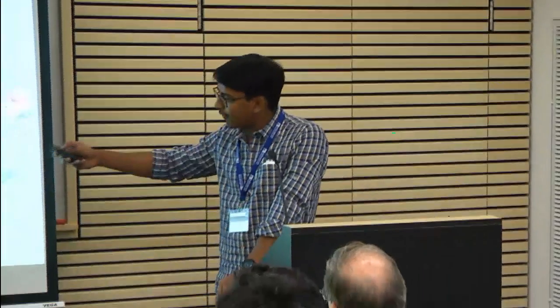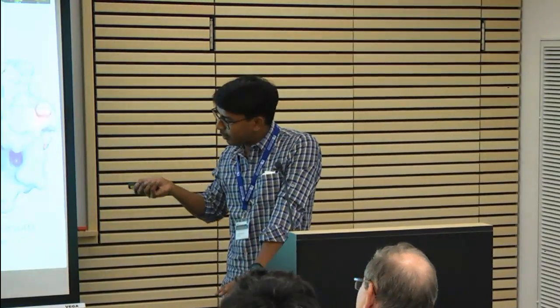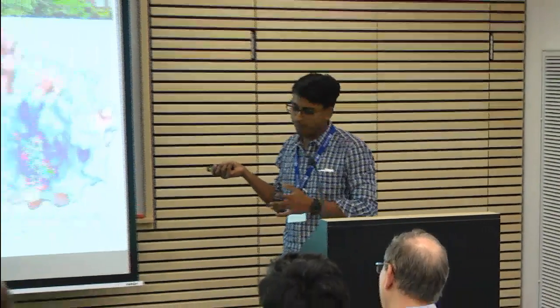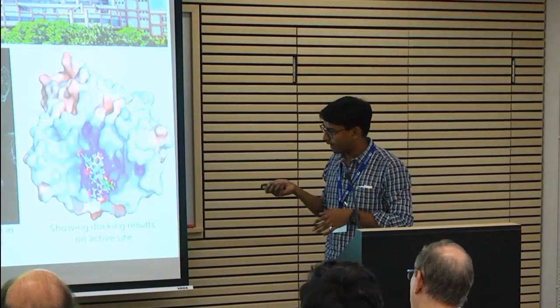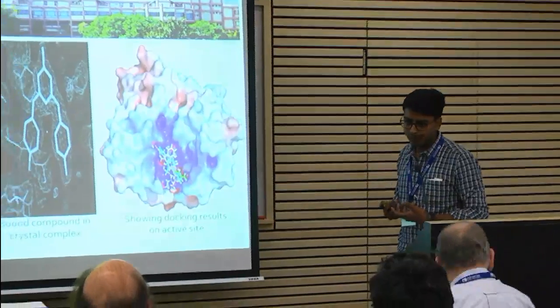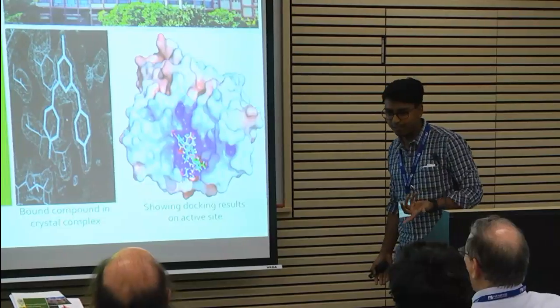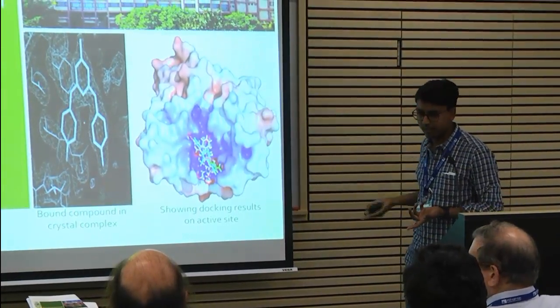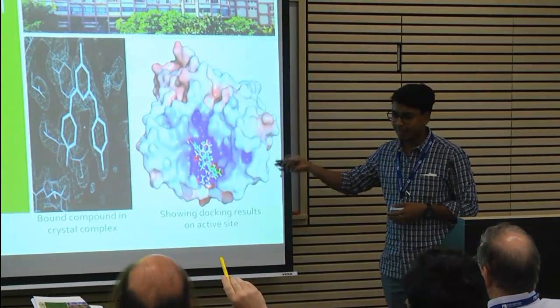We know the active site of the enzyme. We are specifically looking for compounds which block it. It contains a cysteine in its active site, so we are trying to block this with a covalent modification and through molecular docking. We got some compounds initially, and we tried co-crystallization. So one of the structures is there. We got only one with this. This is not binding at this position. It's binding somewhere else, maybe allosteric sites. It's not in the active site.